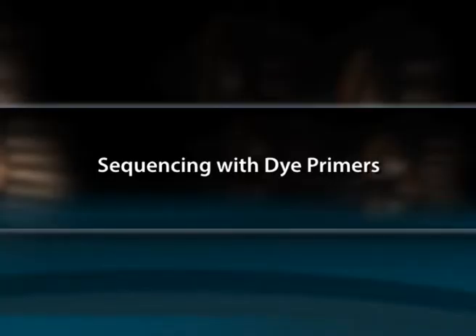Sequencing with dye primers. 4 separate reactions are performed when using dye primer based sequencing chemistries. Each reaction is labeled at its 5' end with any one of the 4 different fluorescent dyes. Each of the 4 sequencing reactions will contain a fluorescently labeled either blue, green, yellow or red labeled primer. The color of each reaction corresponds to either A, C, G or T.